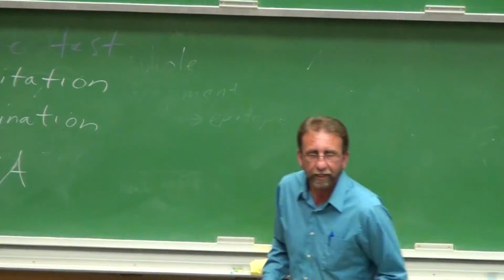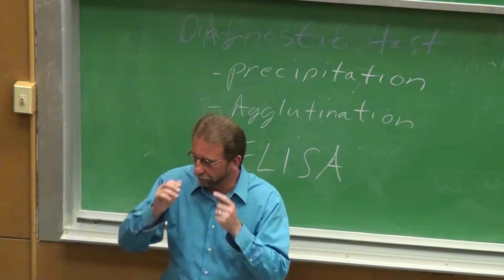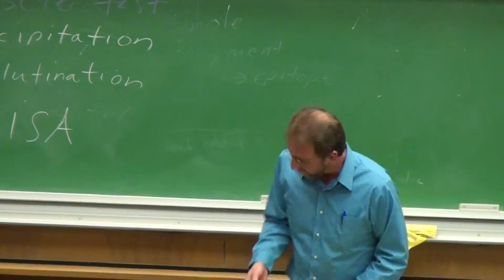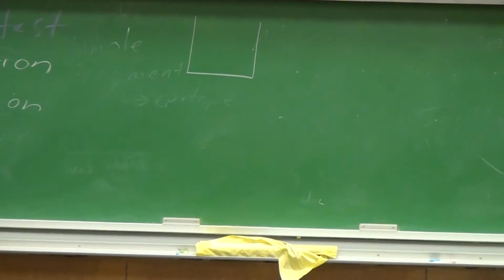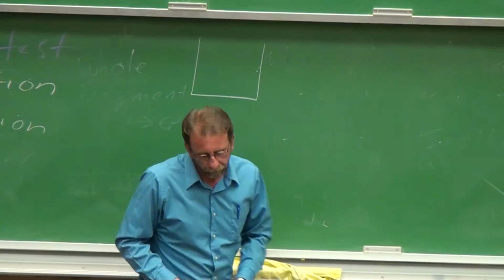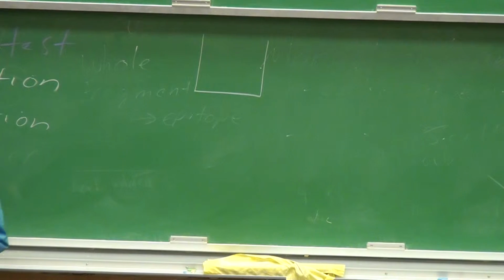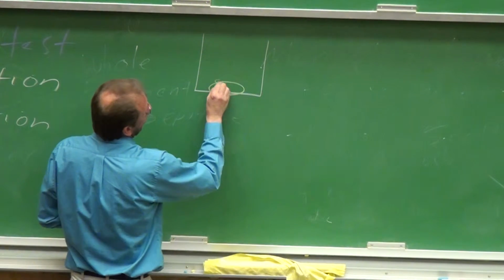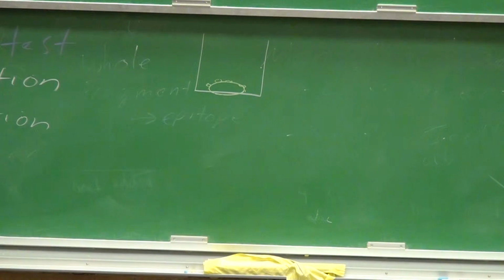So what we do here is that we look at various concentrations of the sample to see the reaction. You start with little plastic trays with 96 wells in them. In this well, you've coated it with, it could be the antibody or it could be the antigen. It could go either way. But let's make the assumption now that you've put the antigen in these wells. Okay?